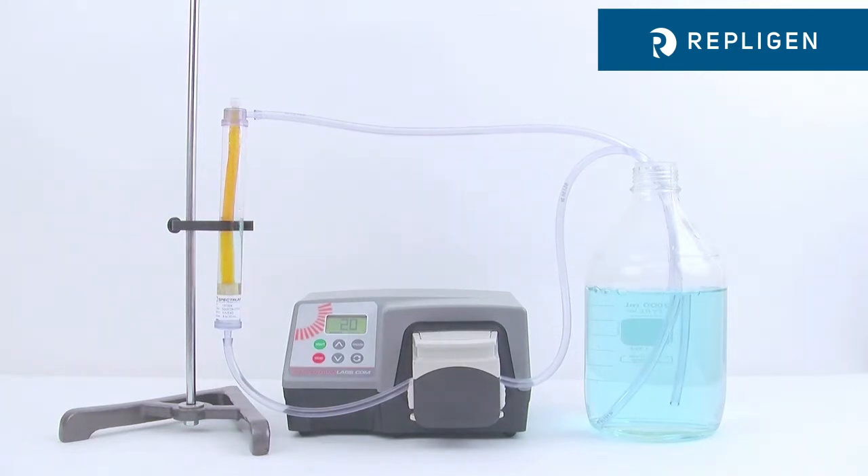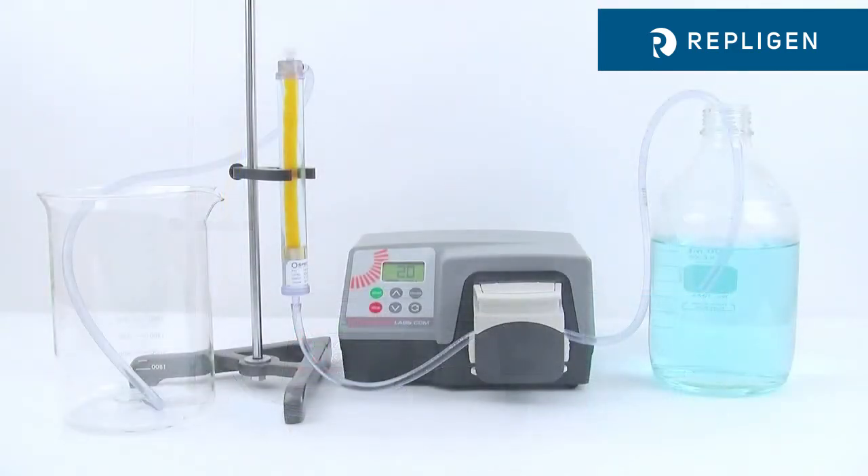Solutes are quickly swept downstream as they diffuse through the membrane, maintaining a high concentration gradient — the driving force for dialysis. Single pass to drain maximizes this transfer rate, avoids equilibrium, and maintains the fastest dialysis possible.